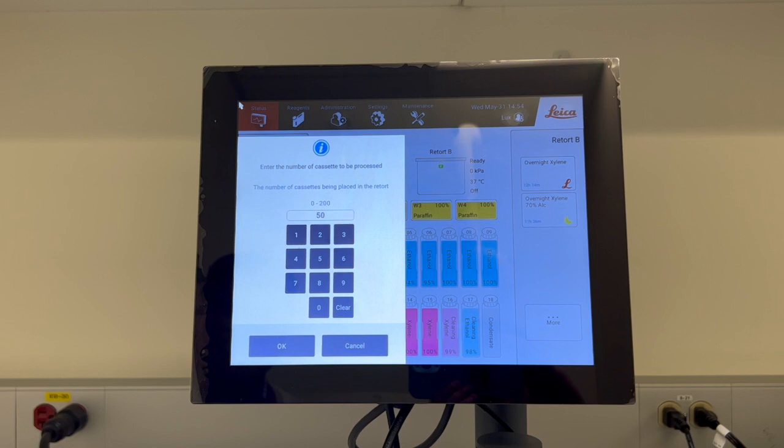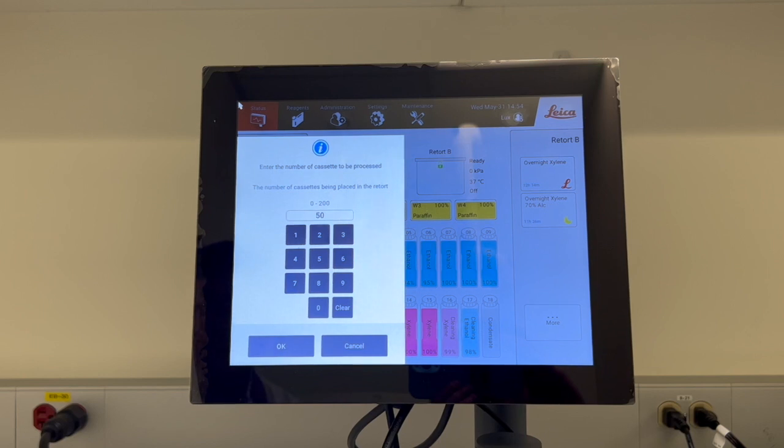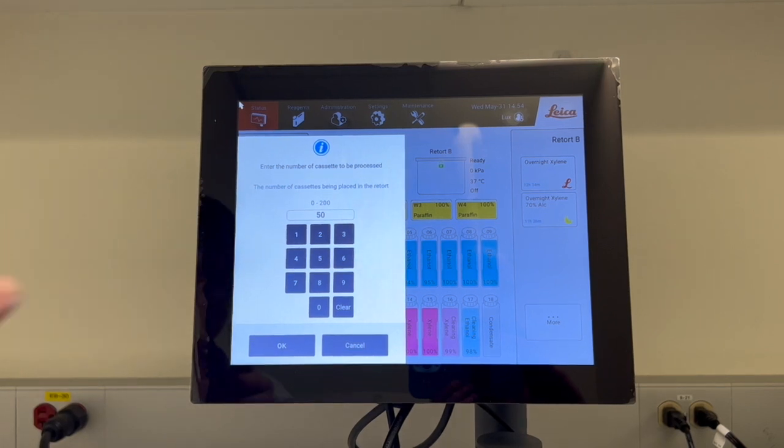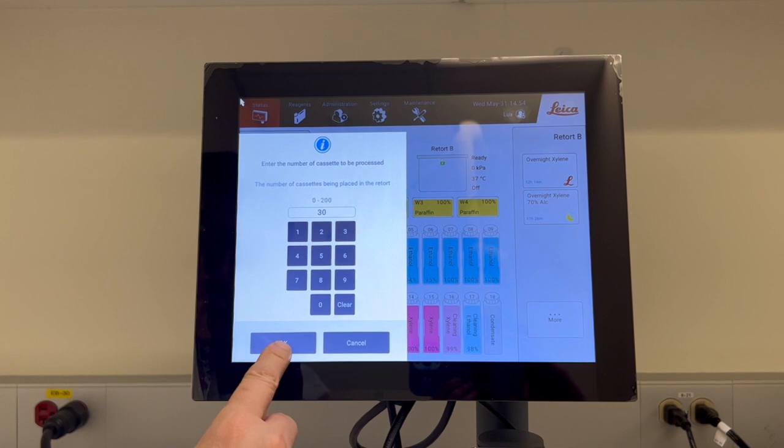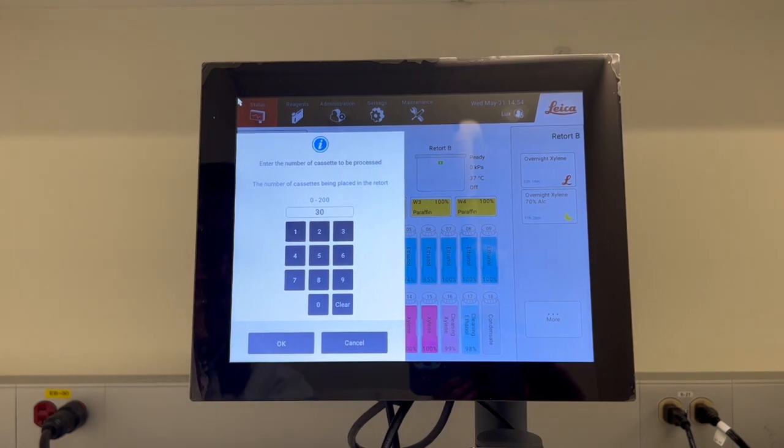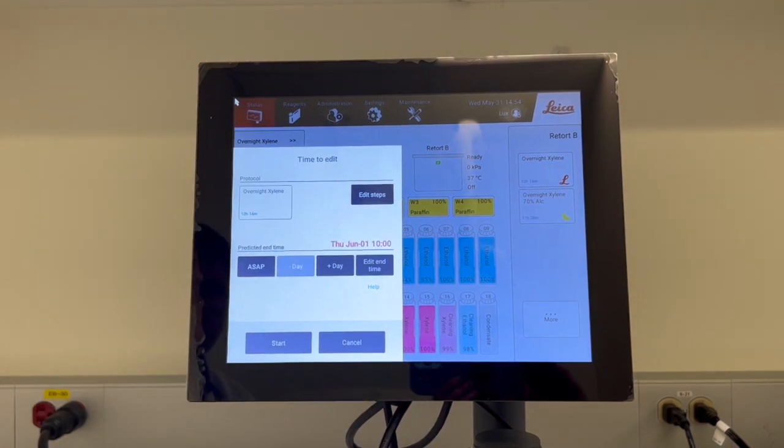Now, you will see a dialog box where you must enter the number of cassettes that are in the retort. It is very important that you enter the correct number of cassettes, since the number you enter will be used by the reagent management system to calculate reagent concentrations. If you enter the wrong number of cassettes, the reagent concentrations will not be correct. Enter the number and then tap OK. For example, if you have put 30 cassettes in the retort, enter 30 and then tap OK.